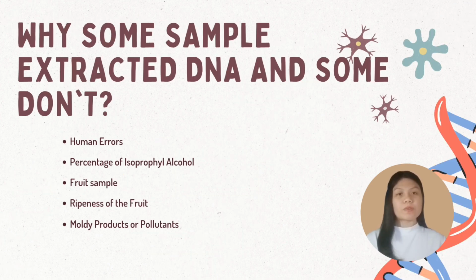Out of 6 groups, only 3 groups were able to extract the DNA from the fruit sample that was brought. Although all of the groups were able to follow the procedure accordingly, it is not the expected outcome for the extraction of DNA from food products. However, a negative result is still a result.